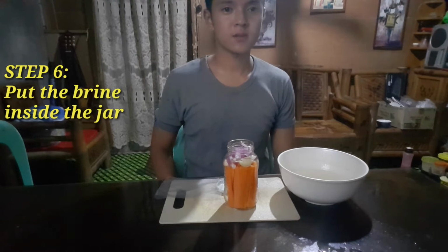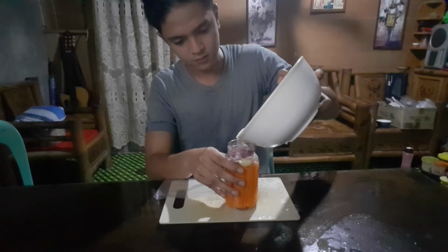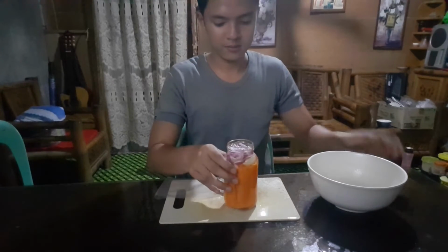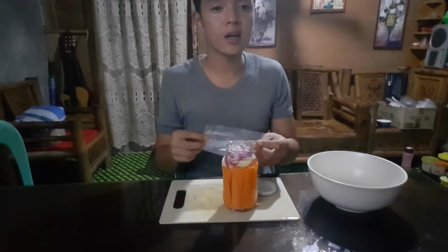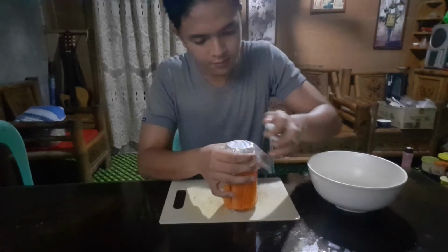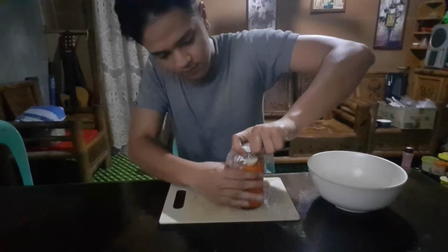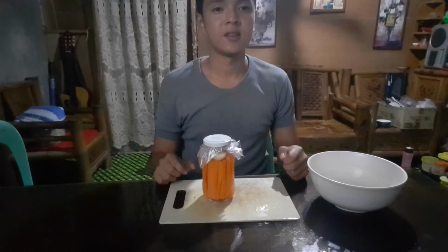And last but not the least, put the brine inside the jar to complete the fermentation process. So here, after that, I will use this cellophane to ensure that the lid is tightly sealed. So here. And yeah, we're done.